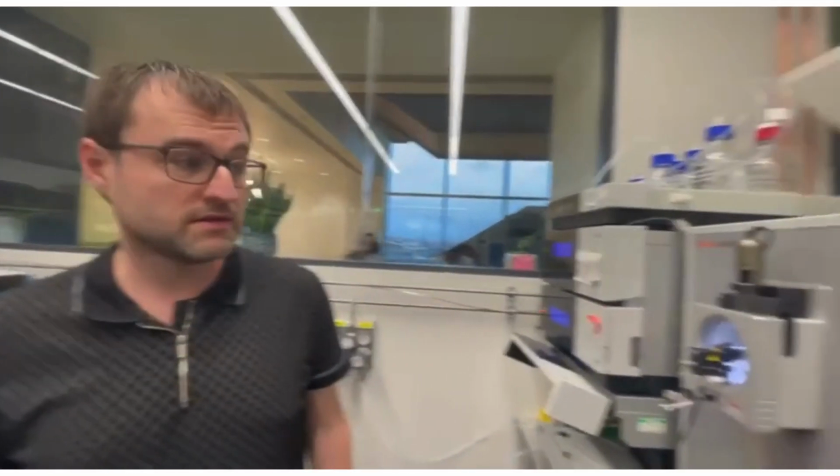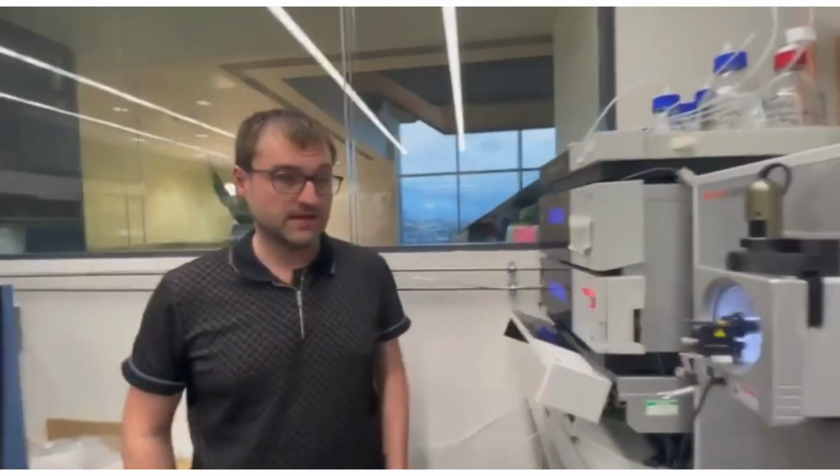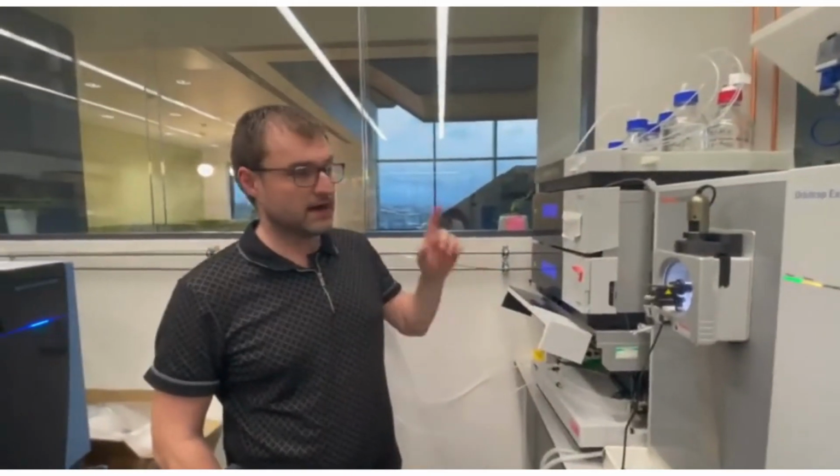So even being older or newer, every single mass spec has to be connected to an LC system, right? Yes. So next to every mass spec there has to be one, apart from one.